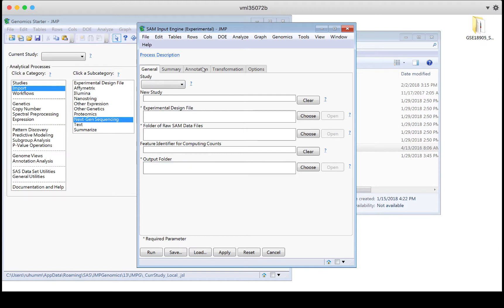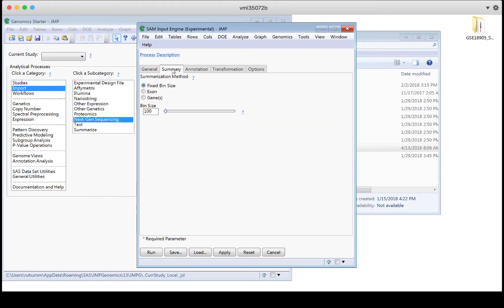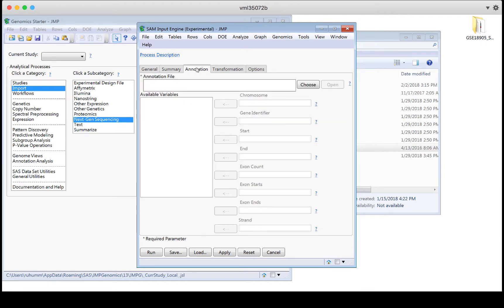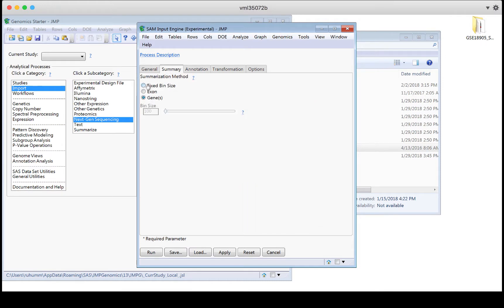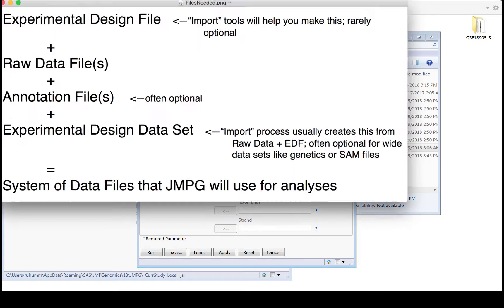On the annotation tab, if I've selected genes as my summarization method for SAM counts, I'll actually see that the annotation file becomes required. If I select fixed bin size, it isn't required because I'm choosing where those transcripts start and end. So you'll see that the dialogue boxes will actually prompt you for the pieces of information that you need.